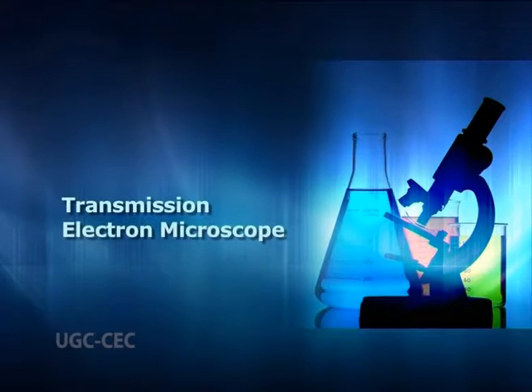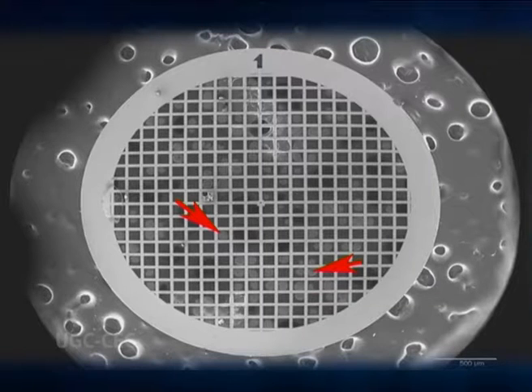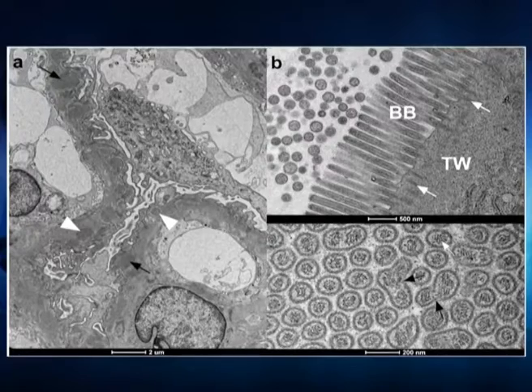Transmission electron microscope. The transmission electron microscope is used to study cells. Ultra-thin slices of microorganisms like viruses are placed on a wire grid. Then these cells are stained with salts of uranium or lead and observed under a transmission electron microscope. The electron beam is scattered by the electron-dense coated parts of the cells and the image is observed on a dark and light background as stained by heavy metals.